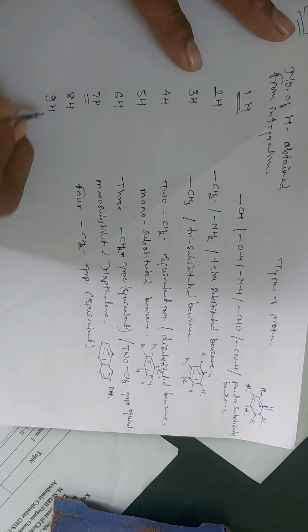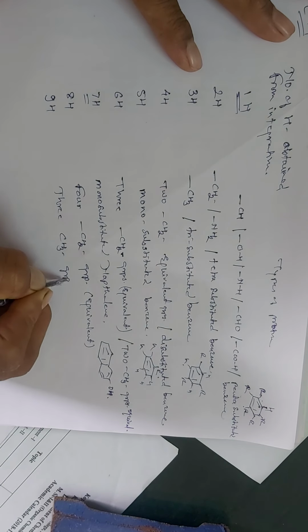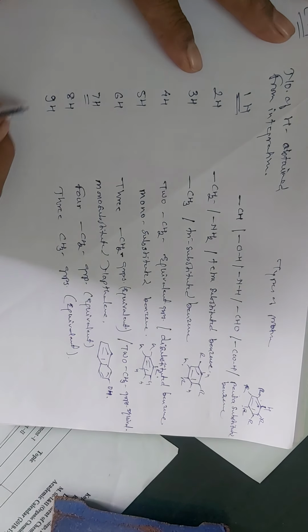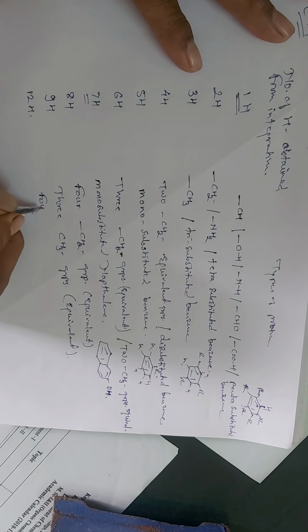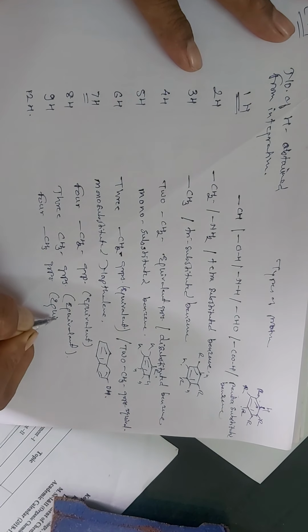So 9 protons, it will be 3 CH3 groups which are equivalent, again magnetically equivalent, means same electronic environment. Then 12 protons, 4 CH3 groups which are magnetically equivalent.